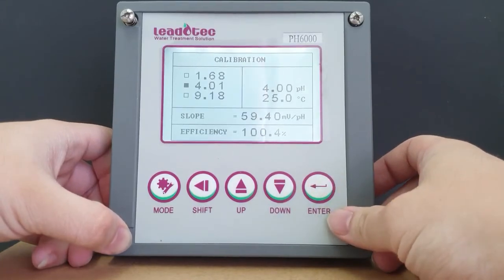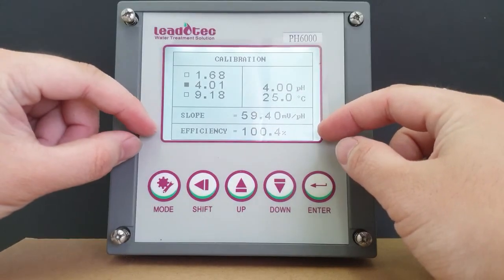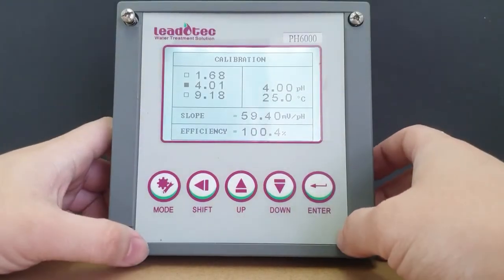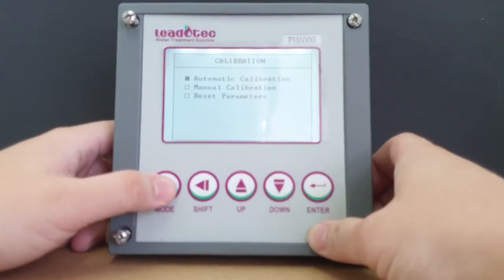And now we have it. The calibration will show you the slope as well as the efficiency of the sensor. Remember to press enter to save and press mode to exit.